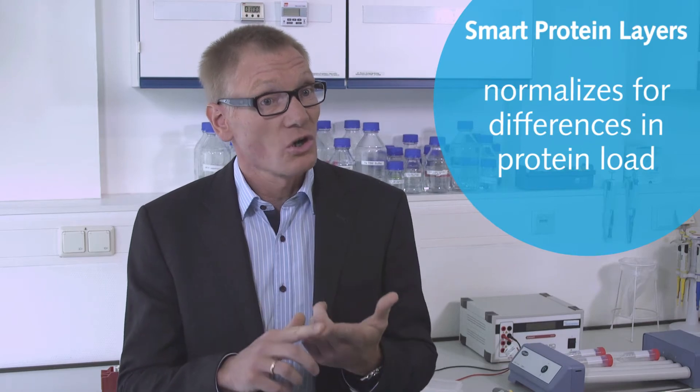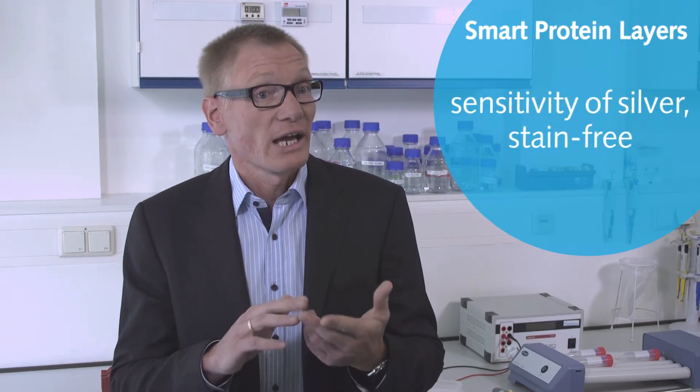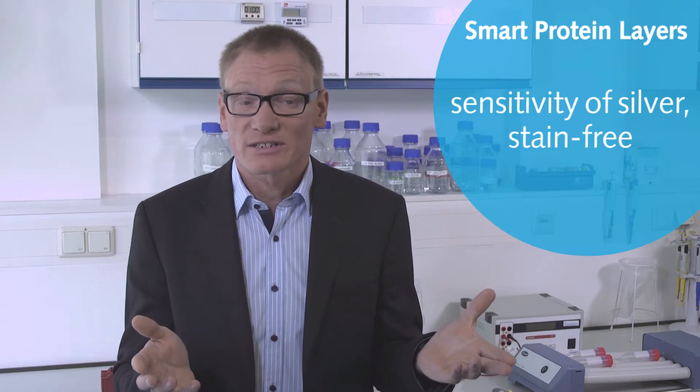Smart Protein Layers provides a technology to detect target signal and its total protein at the same time, which normalizes for differences in protein content or sample loading, and which is stain-free and comes with the sensitivity of silver.